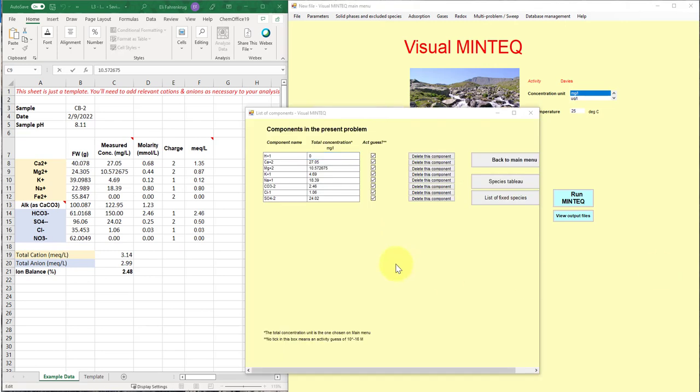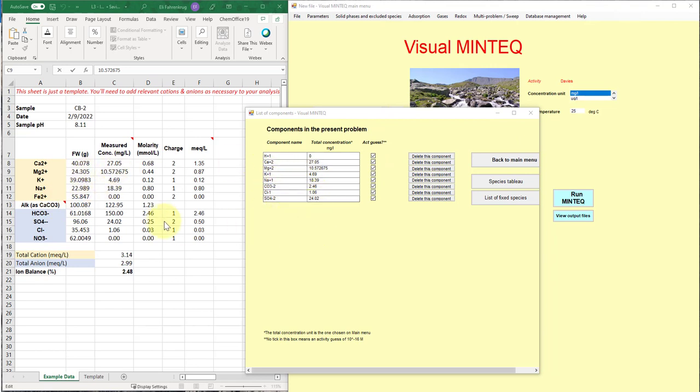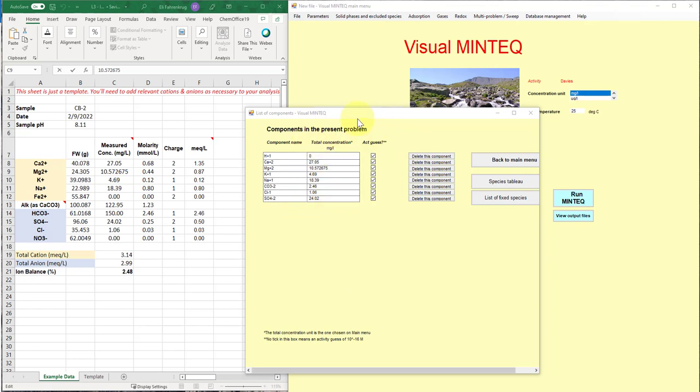Okay. So after I've added all of the species or the components that I've measured, I can take a look at my list and just confirm against all my measured values that everything is being represented. And you can see that it didn't include nitrate because it was measured value of zero or non-detect. I didn't include iron two plus for similar reasons. And so we end up having a list of components in this problem as it's defined that we can then run our model.